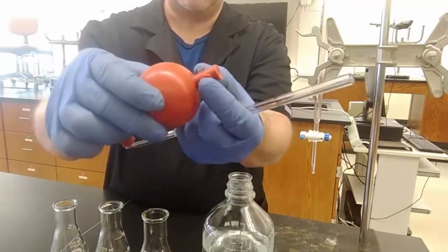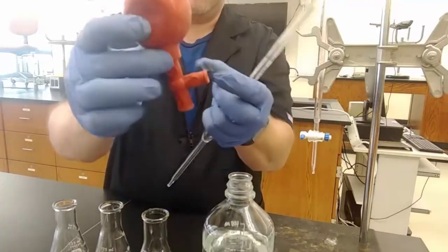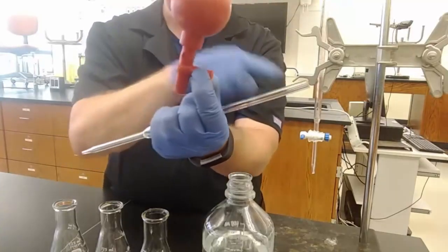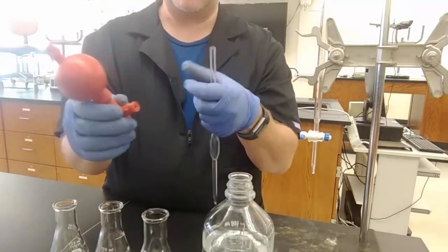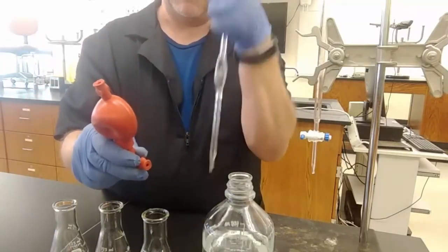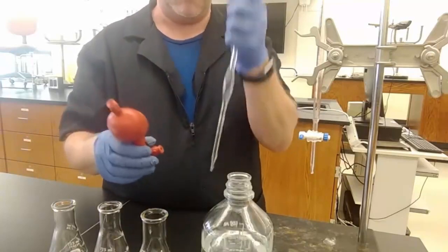The valves on here, whichever valve you squeeze, that's where the air can come out. So the air can come out the top that way, and now it's ready to suck stuff in. If I squeeze this valve right here, that will suck air up in that way. And if I were to squeeze this valve, that lets air in that way, which would allow the pipette to drain. I'm kind of halfway old school using this type of pipette bulb. I like to suck it up with the bulb, and then put my finger on the top of it to get it exactly on the line and let it drain out. You can use the bulb to let the liquid out, just not the way that I'm comfortable with.